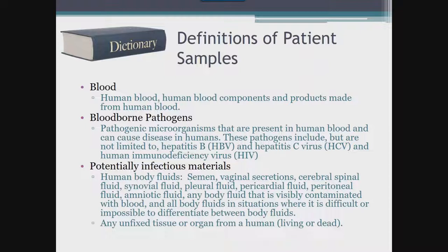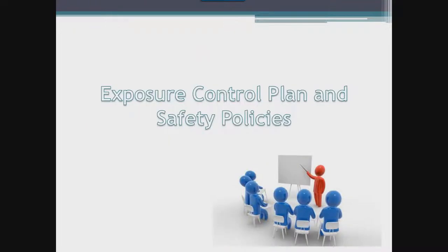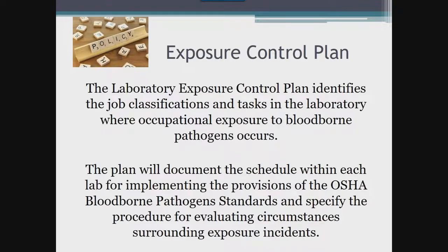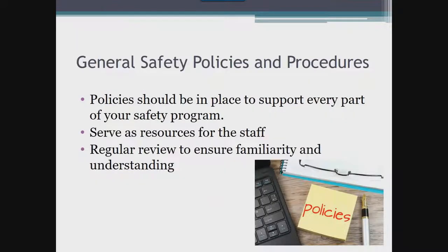The exposure control plan, similar to the chemical hygiene plan, is a document or set of documents that outlines how we keep our employees safe from all the biological agents they could be exposed to in the handling of blood, body fluids, and tissue every single day. Within the exposure control plan, we must identify — according to job classification or job description — whether and how bloodborne pathogen exposure occurs. Additionally, the exposure control plan is meant to specifically lay out all the components of the OSHA bloodborne pathogen standards and how they are carried out by the laboratory. You should also have general safety policies in place to support every part of your safety program.